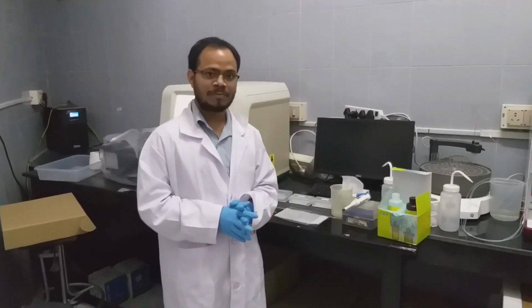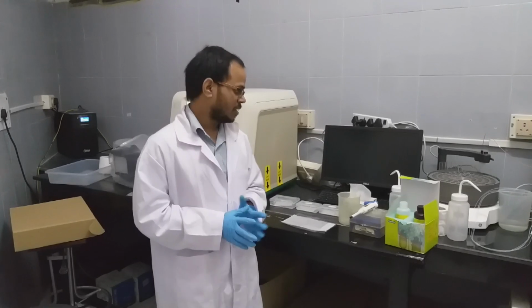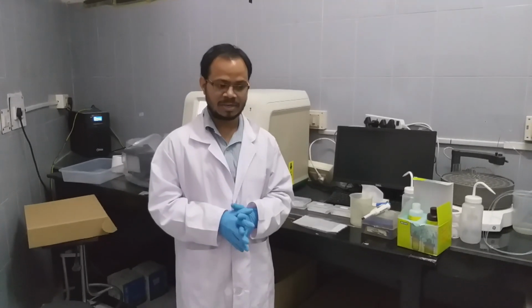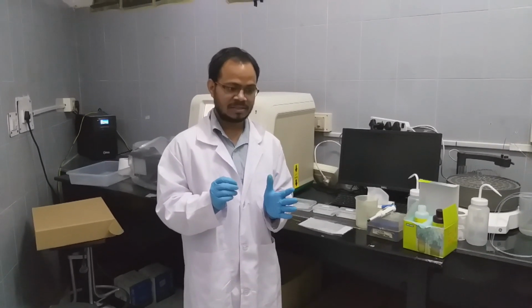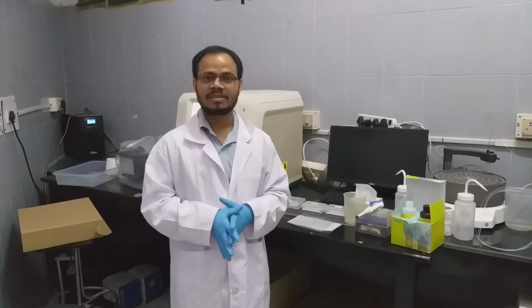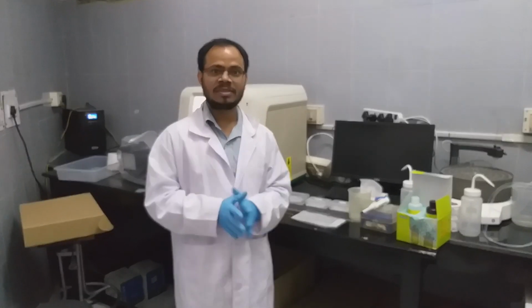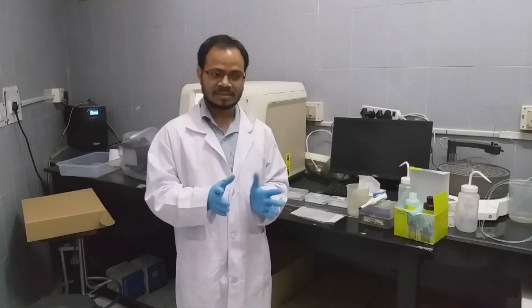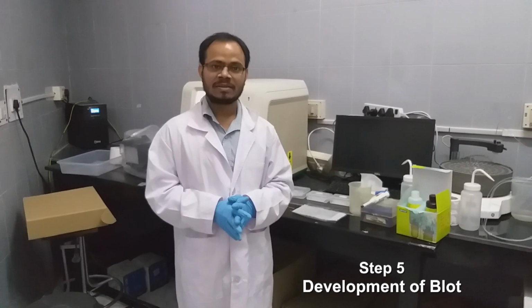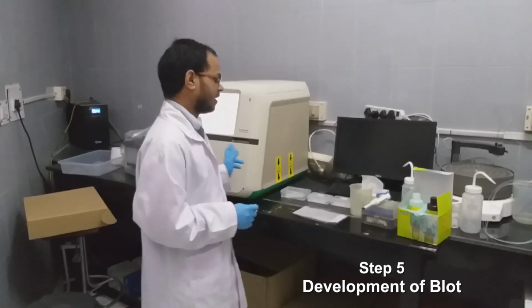Luminol, in the presence of hydrogen peroxide and peroxidase enzyme, which is present in the horseradish peroxidase conjugated secondary antibody, is converted by the horseradish peroxidase into excited state luminol by deprotonating and oxidizing it. This excited state product gradually loses its energy by releasing luminescent photons. That light will be detected using this instrument.